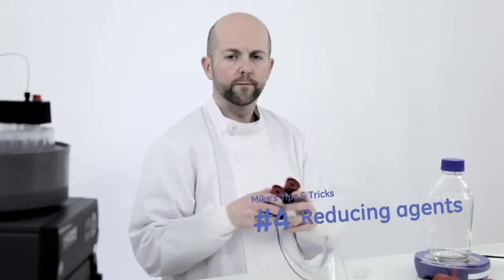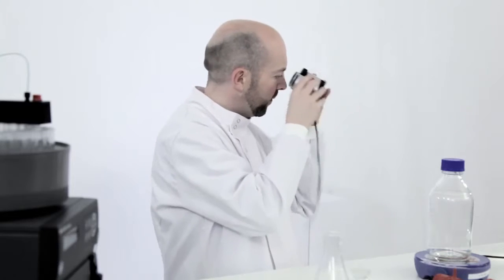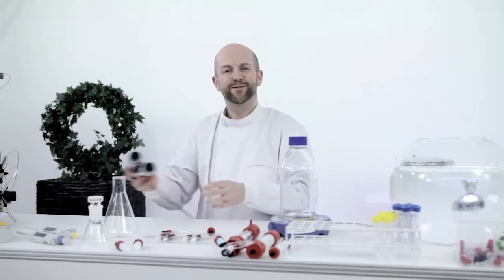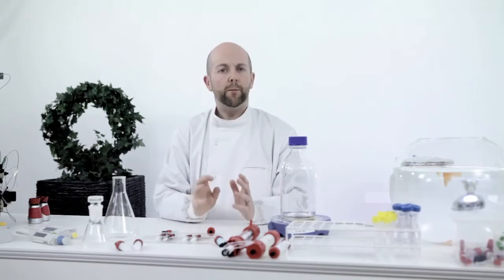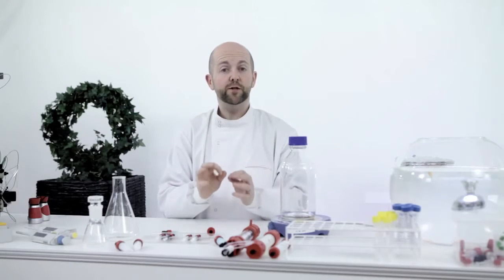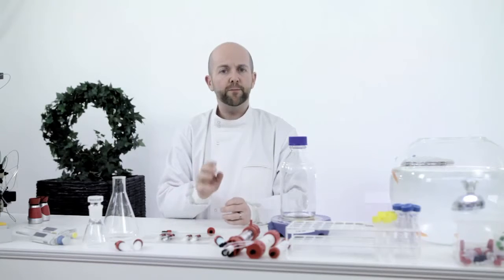Mike's tip number 4, remember you have much more freedom using reducing agents than you think. Yes, you can use all the usual reducing agents. The important tip is always to do a blank run first without reducing agents. Then apply the sample to the column in binding buffer containing the reducing agent.